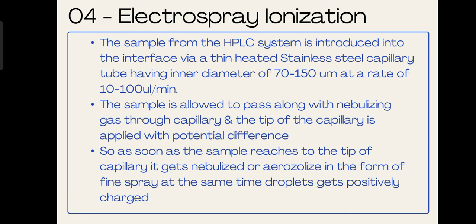Now, when the sample along with the nebulizing gas reaches the tip, the role of the nebulizing gas is to cause the analyte molecules to aerosolize, or nebulize, in the form of fine tiny droplets. At the same time, due to the supply of positive potential at the tip, these droplets will get positively charged. So a single droplet which is produced will have numerous positive charges in it.